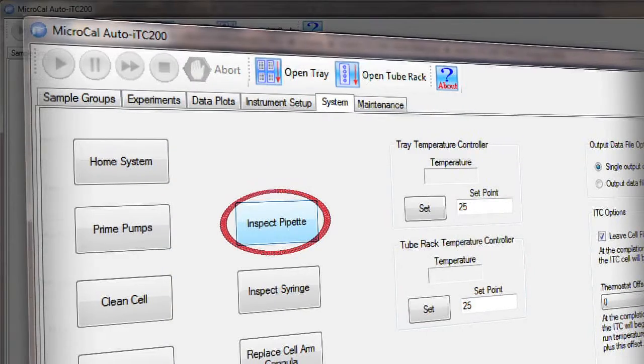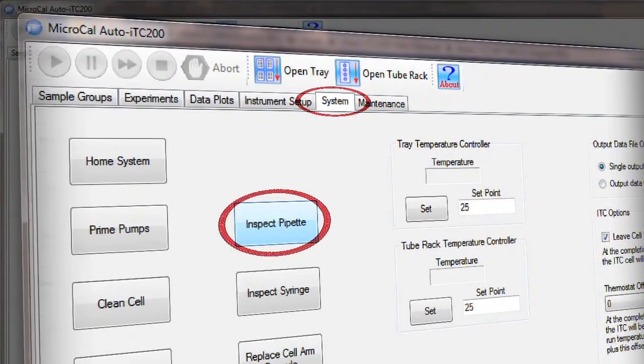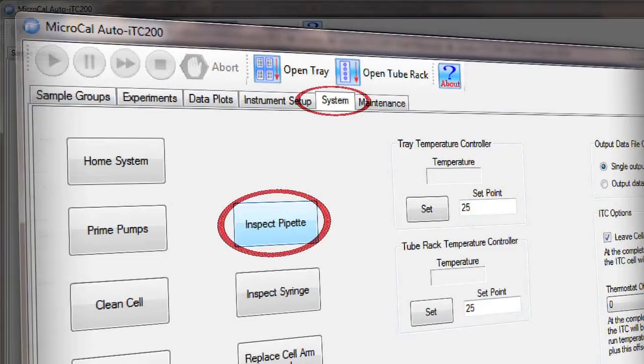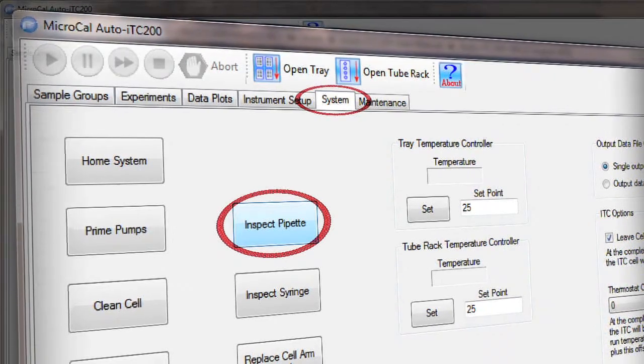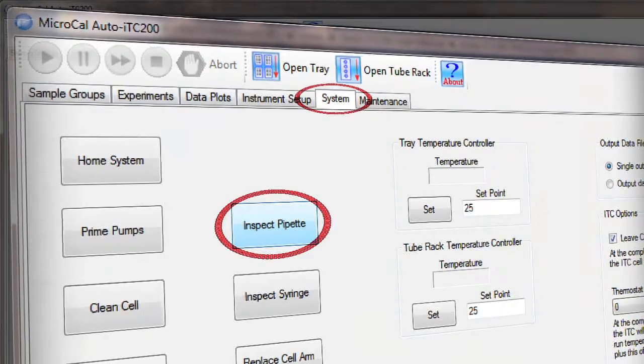Then you click the inspect pipette button in the system tab of the Auto ITC 200 software. This brings the pipette arm around to the front where it's more easily accessible. Now we can open the door.